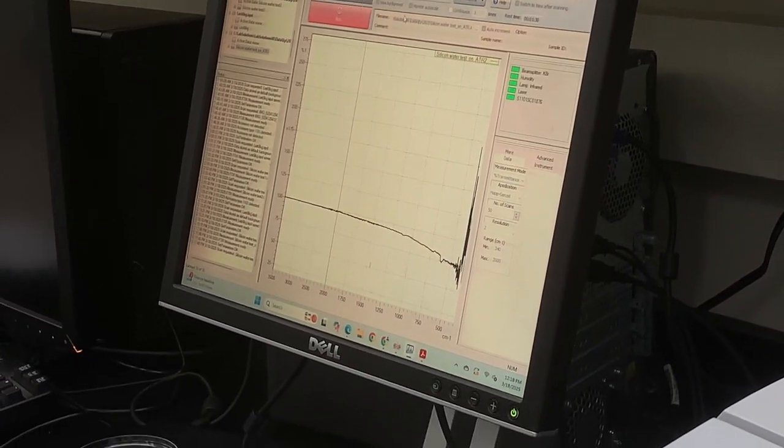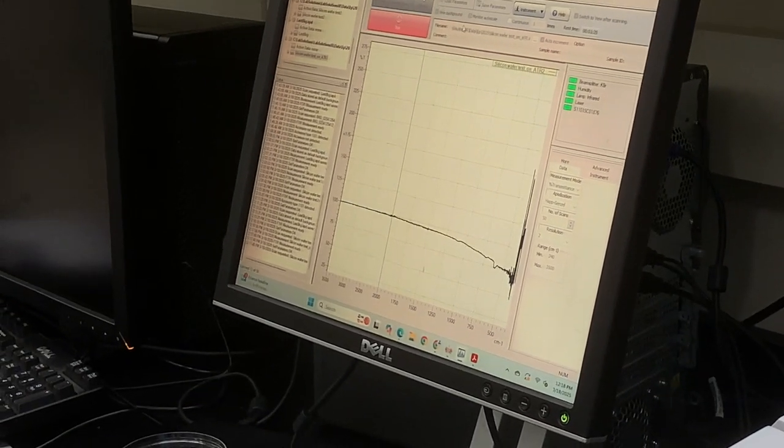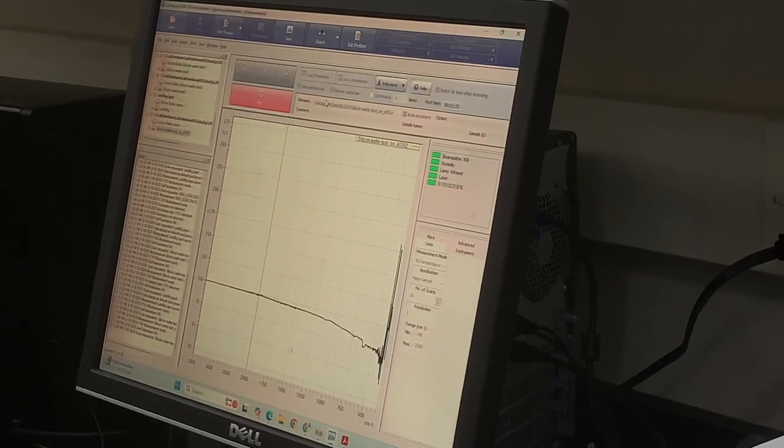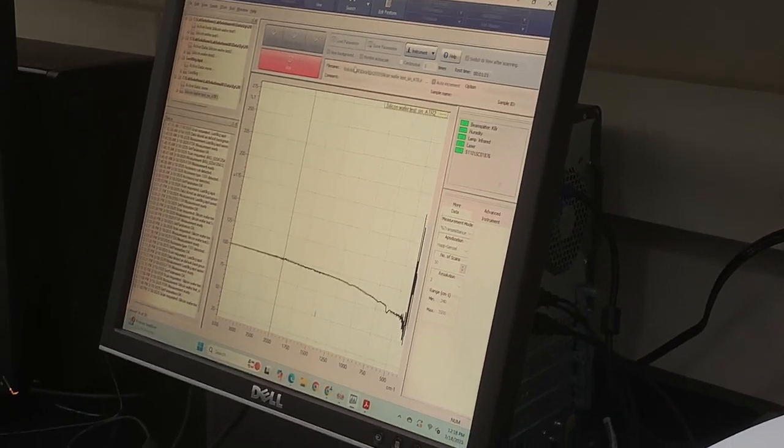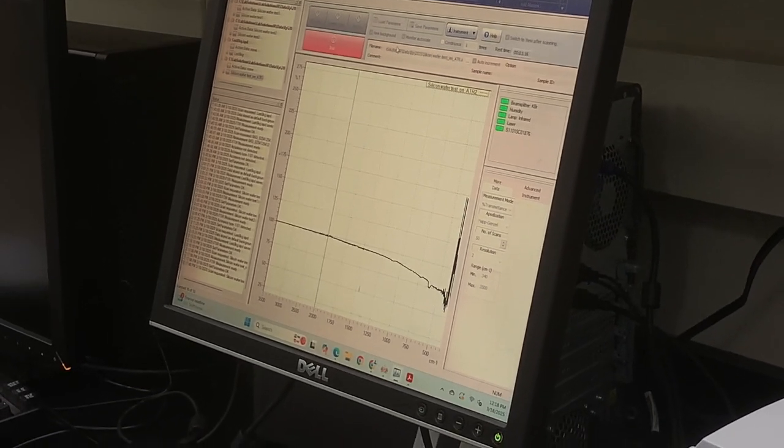Yeah. And the reason people would use different crystals is because of different absorbances and different ranges, right? So some things you need that germanium crystal. But I think diamond is also a common one. It is. Most people use it, right? Yeah.